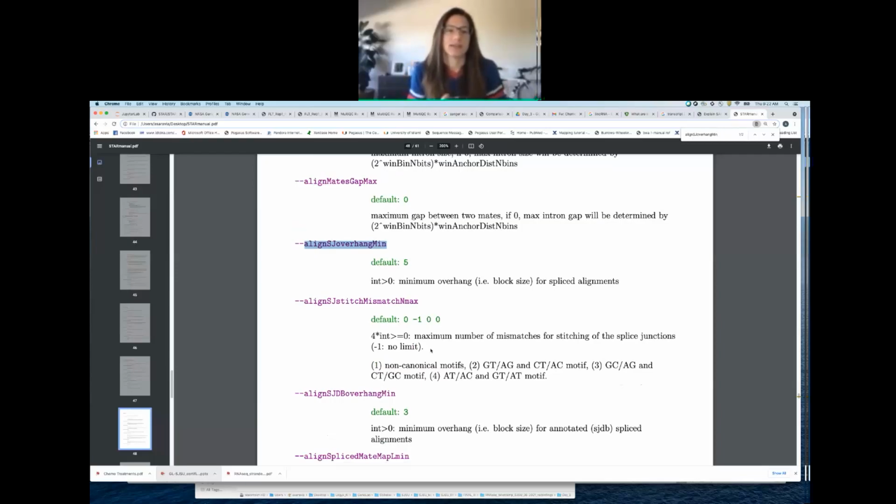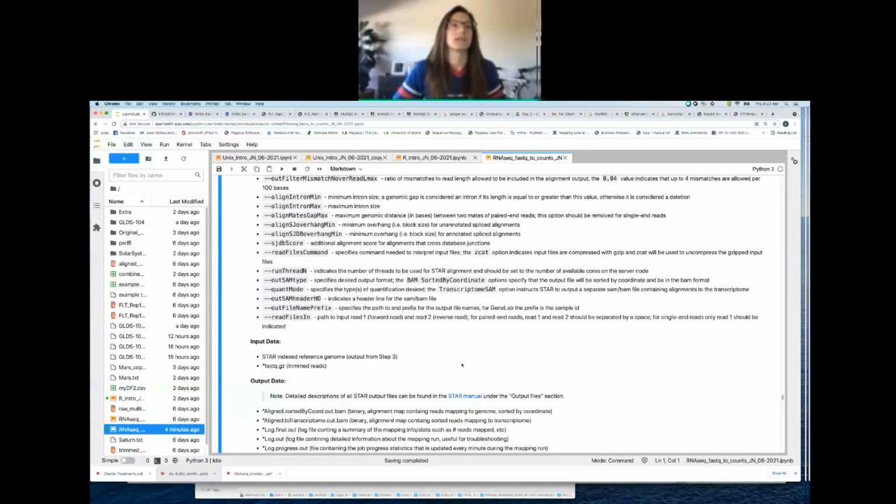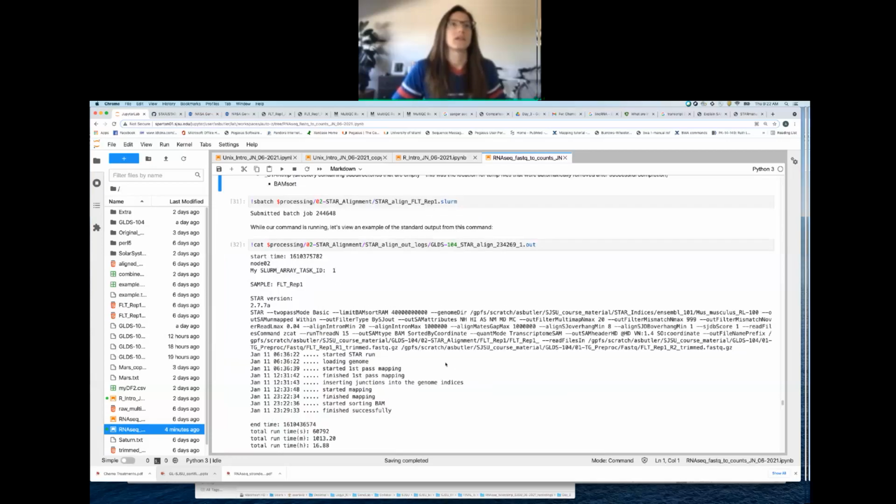I don't want it to take time now on the whiteboard, but during the break, I will set up a whiteboard with some pictorial representation of this overhang. And then we'll start after the break with going over that overhang and how it's calculated. So hold on to it, and I'll give you a pictorial representation during the break. Okay.